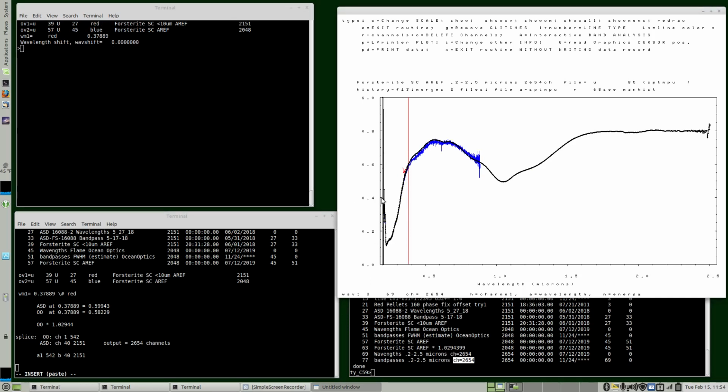Now the data down here is also a case where it's probably spurious, so the good data is probably out to there. Now we have two choices. Actually, we also need to turn off the overlays. OV, redraw.